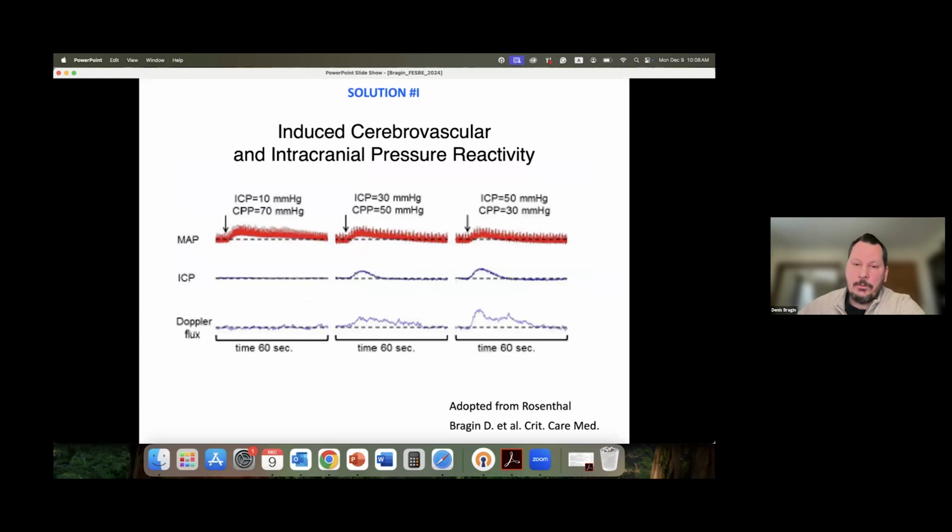Seems I'm getting out of time. But multiphoton microscopy still is not usable for clinical research, and we found two solutions for how to do it in clinics.